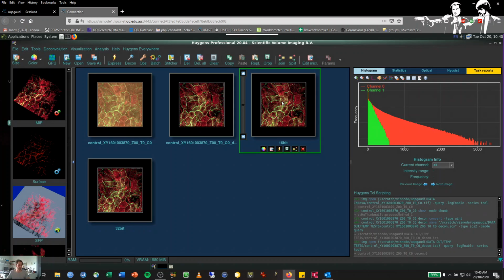So no reason not to do that in the future. I strongly suggest everybody does that. Transform your output data from 32 to 16-bit unsigned integer and save it as ICS2. It will open perfectly fine in every single software that we know so far, and will conserve all the metadata and will be much easier to transfer, manipulate, copy, etc.